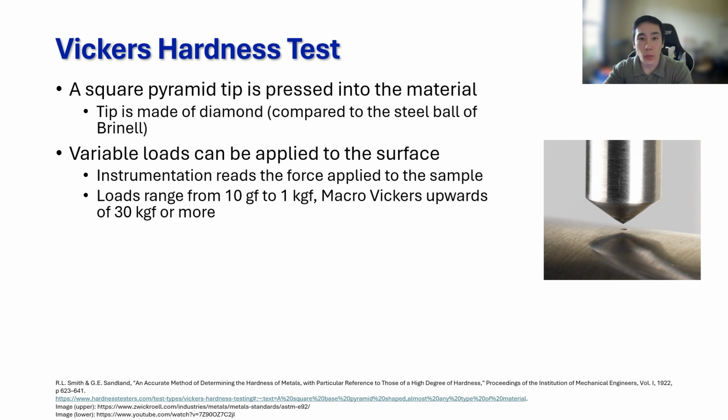The Vickers instrument works by applying a compressive force onto the surface of the sample with a square pyramid diamond indenter, as we can see in the image to the right. This plastically deforms the material by permanently displacing the atoms that it interacts with, and the resistance of the material to being deformed is measured by comparing the size of the indentation and the force required to create it.